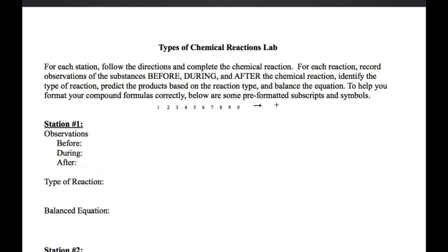You're going to have to pay attention to the substances that I'm using in these videos, as well as the instructions that pop up before each video in order to put together what are these substances that are being mixed together. Those are going to be your reactants, stuff you put before the arrow, and then use your knowledge about what type of equation that is going to be, what type of reaction it is, in order to predict those products, just like as if it was one of those problems in our packet on pages 11 through 14 that we've been predicting products on. If you need help with that, come in for help.